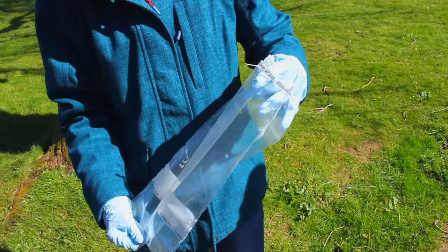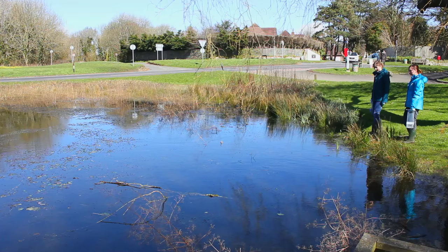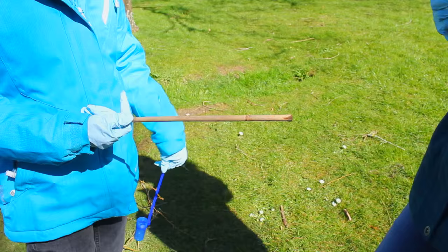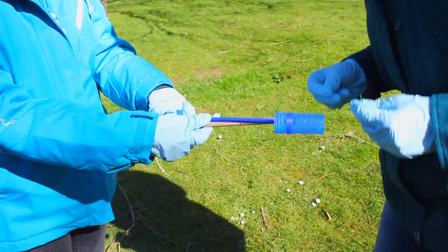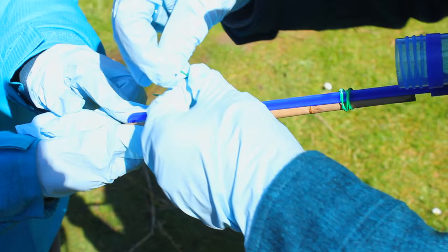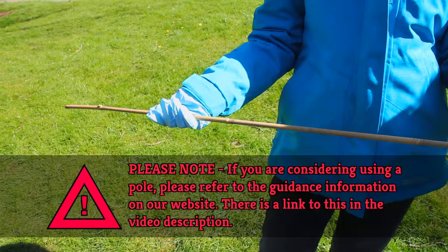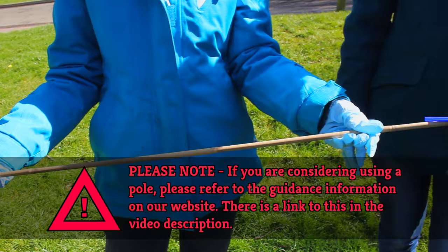The bag will stand up by itself when full, but on uneven surfaces it helps to have someone else to hold it for you. Sometimes, as is the case at this pond, it is difficult to reach the water from the bank due to a muddy margin or vegetation growing at the edge of the water. We don't want to contaminate the sample by going in the water, so we'll attach the ladle to a pole instead using elastic bands or twine. You could use a walking stick, bamboo pole or any sturdy stick for this.